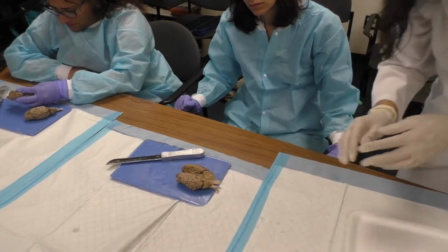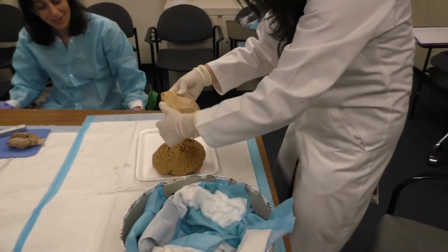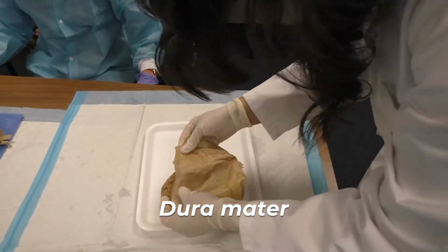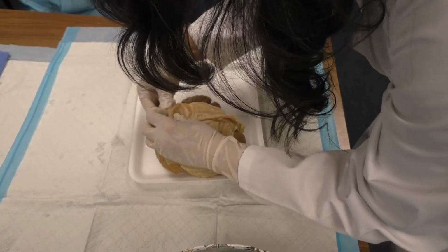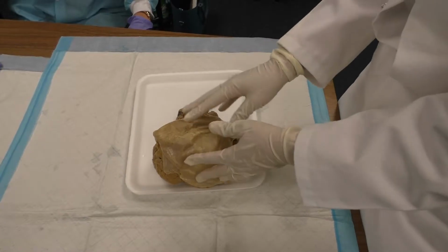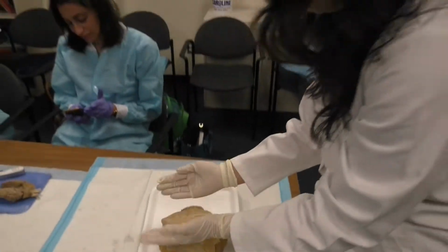I brought this to show you: this is the dura mater, a little cap that goes all the way around. Cerebral spinal fluid flows in the space between the dura mater and the brain, and it provides protection for the brain, because what's just outside here? The skull. The skull is hard.